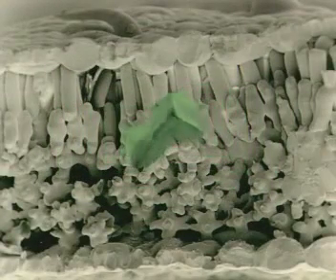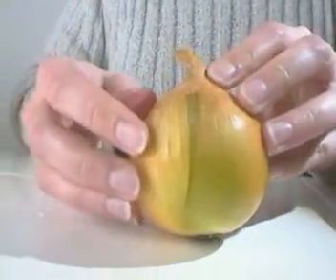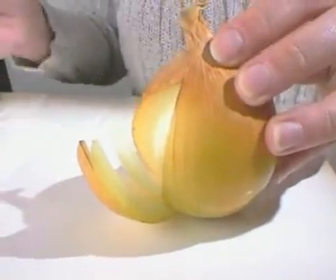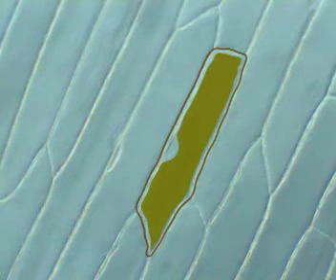The scanning electron microscope shows the three-dimensional shape of the cells, but it doesn't show what's inside. By removing a thin piece of onion tissue, just one cell thick, and placing it onto a slide, it's ready to view under a light microscope. The cell walls are easily visible. The vacuole is pushing the cytoplasm to the outer edge of the cell. Squashed to the side is the nucleus.